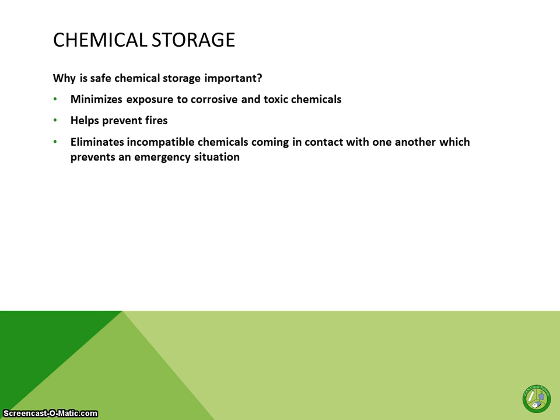A little word on chemical storage. Why is it important? Well, it minimizes exposure to corrosive and toxic chemicals, helps prevent fires, and it eliminates incompatible chemicals coming into contact with one another, so this prevents an emergency situation.